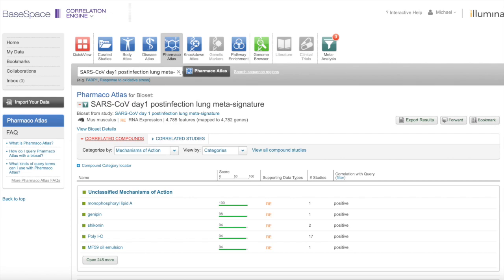In this section, we will analyze our day one infection meta-signature with a pharmacoatlas and base-based correlation engine to look for drugs and compounds that can have an effect on the genes that change with coronavirus infection.